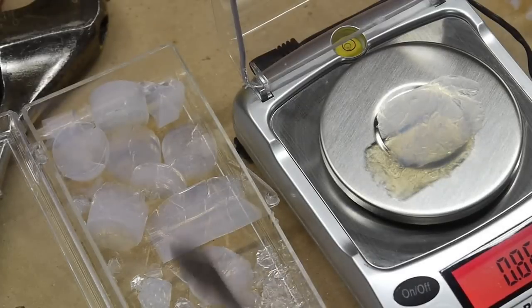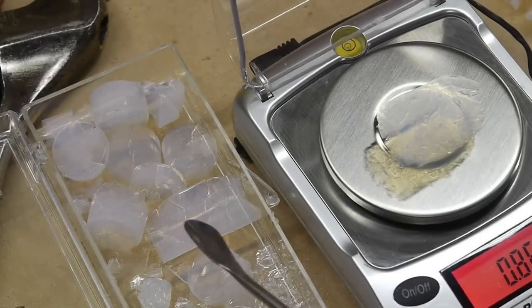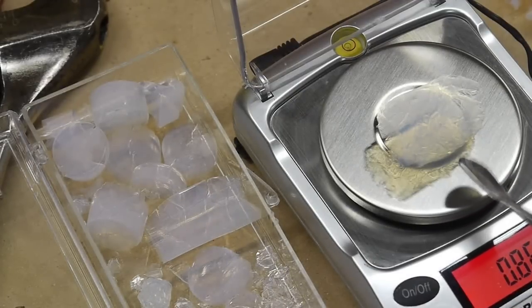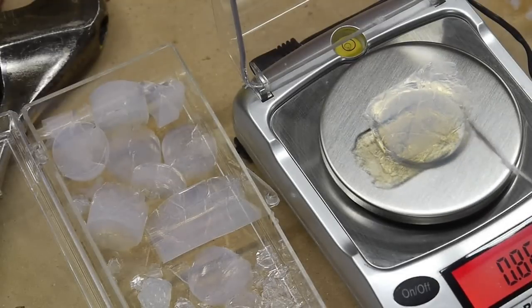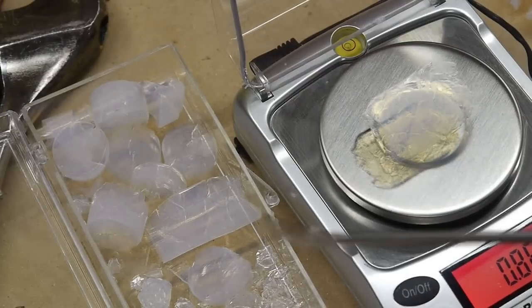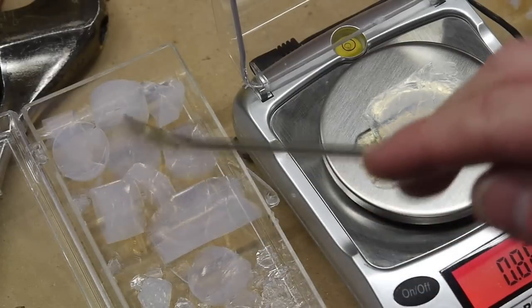So these aerogels here are the ones that I made with the supercritical CO2 method. And this is an aerogel that I just made today with the supercritical methanol method. And there's less shrinkage.